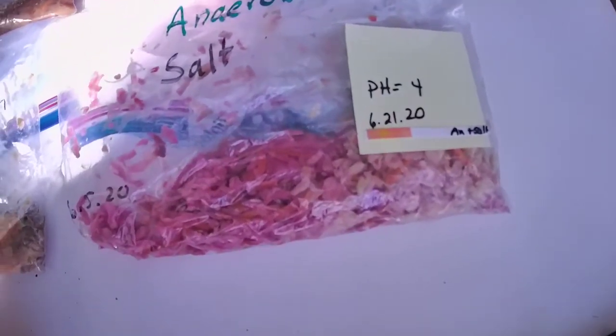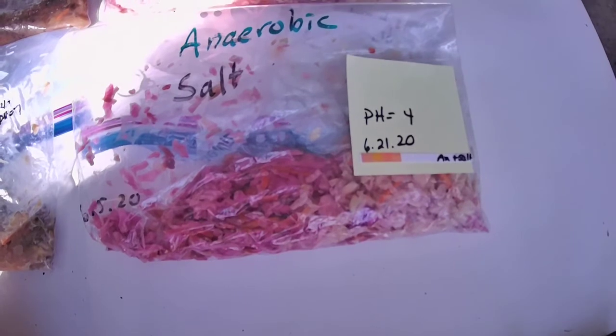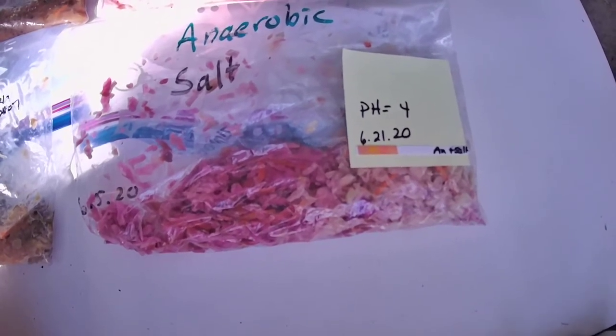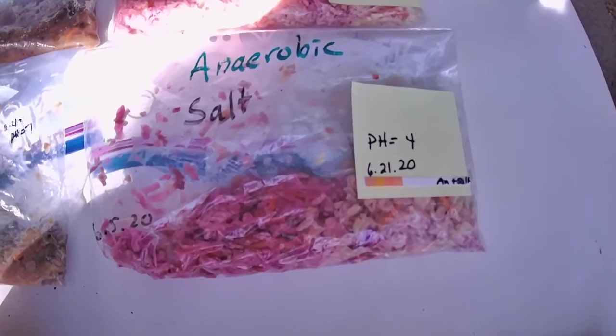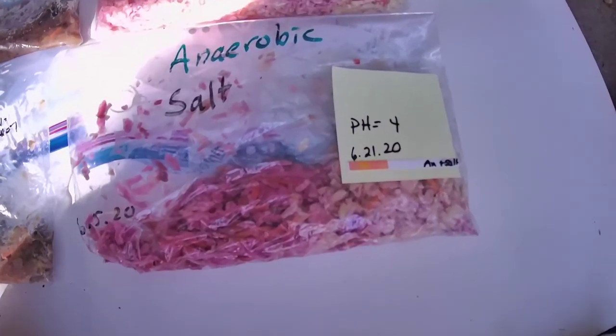Okay, folks, so again, what we're going to do, we're going to culture to SAB and TSA. Today we're going to be making smears and doing gram stains, and the final thing we're going to do, folks, is we're going to do serial dilutions, try to get some cell counts on these guys, and that'll be a separate video. Okay, we'll see you on the next one.